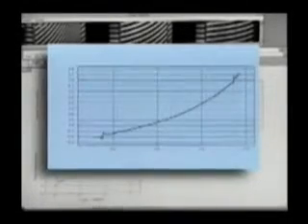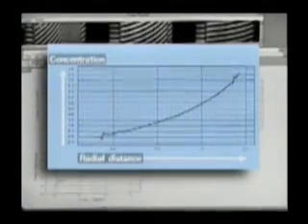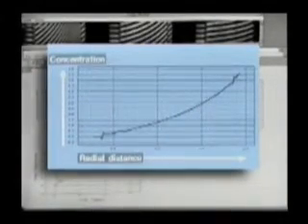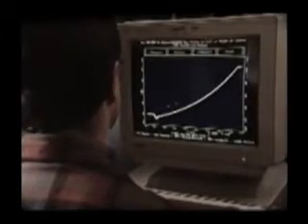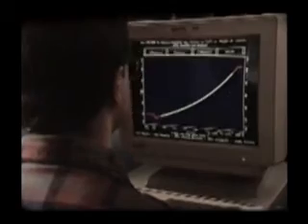The graphs at the bottom of the screen plot amount of fringe shift against distance from the center of rotation. These graphs give us our working data. Now we're ready to extract molecular weights from the data. First, the range of relevant data is selected by the investigator.